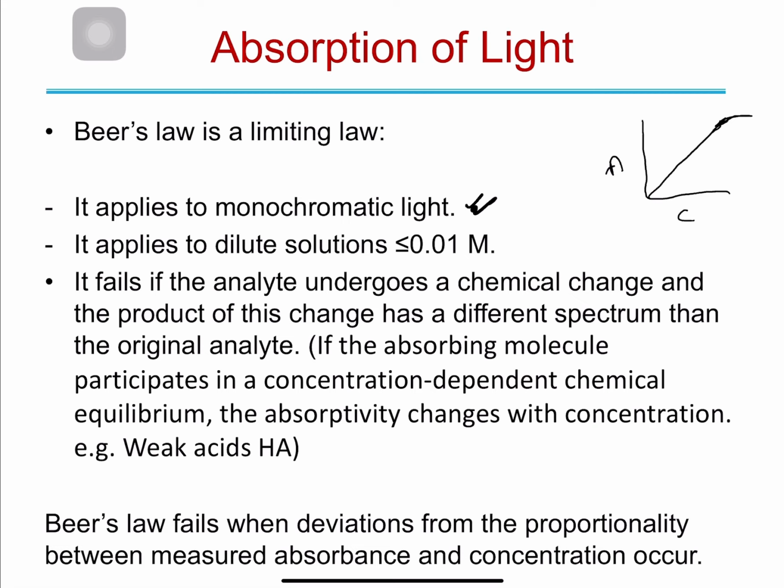Also, if your substance undergoes any chemical change with a change in the concentration, you cannot use Beer's law. For example, you know that weak acids are concentration dependent.